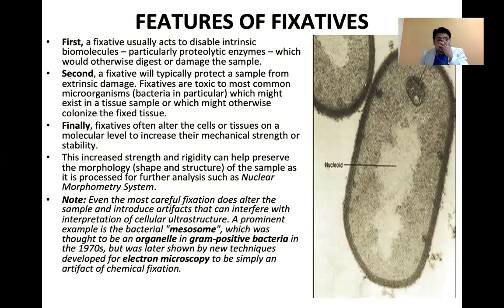Okay. Features of fixation. First, it acts to disable intrinsic biomolecules, particularly proteolytic enzymes, to prevent necrosis and damage. Second, it protects a sample from extrinsic damage, particularly bacteria.